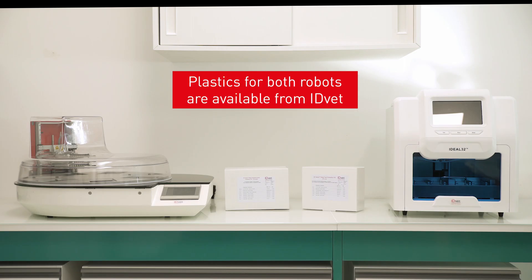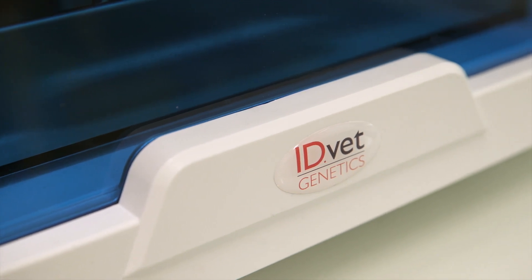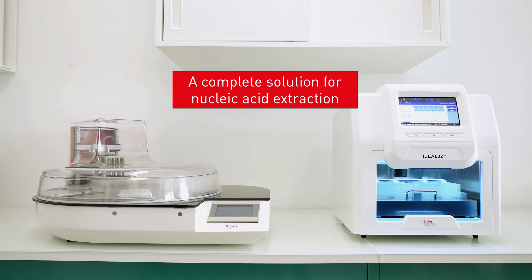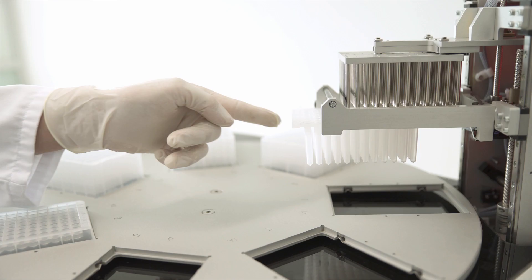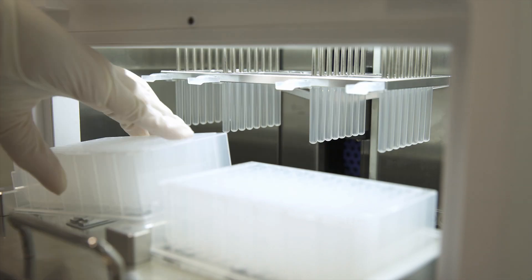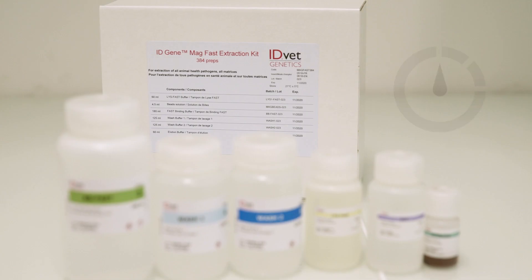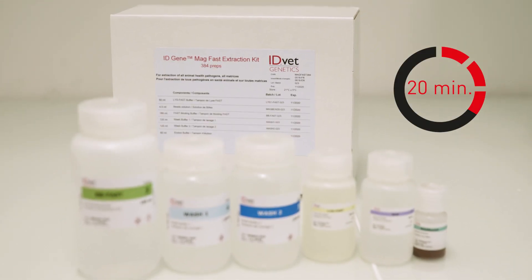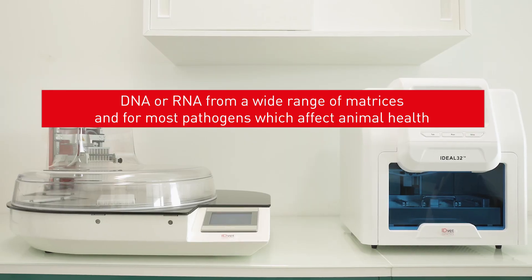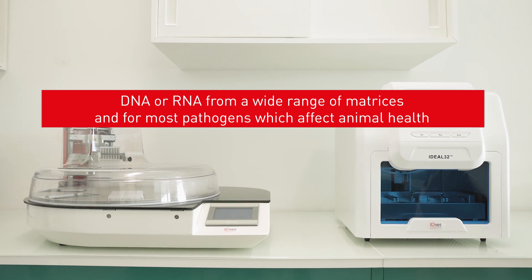Plastics for both robots are available from IDVET. In conclusion, IDVET offers a complete solution for nucleic acid extraction, including two powerful extraction robots suited to your needs, their associated plastics, and magnetic bead extraction kits. The MagFast extraction kit may be used to extract DNA or RNA from a wide range of matrices and for most pathogens which affect animal health.